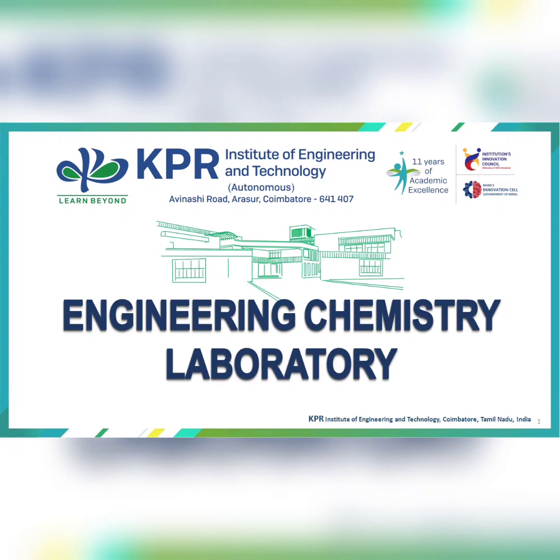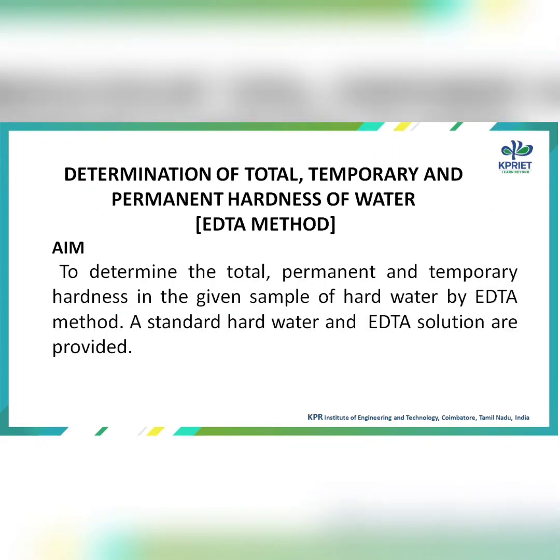Welcome to the virtual lab of engineering chemistry prepared by the Department of Chemistry of KPR Institute of Engineering and Technology, Coimbatore, Tamil Nadu. The first experiment of the course is the determination of total hardness, permanent hardness, and temporary hardness of water by EDTA method.